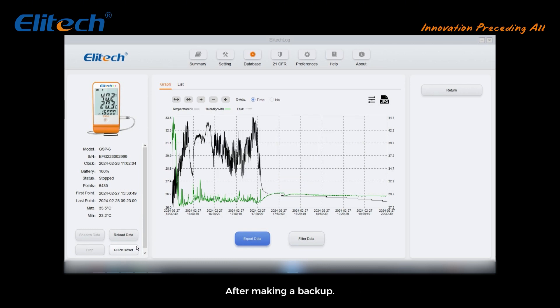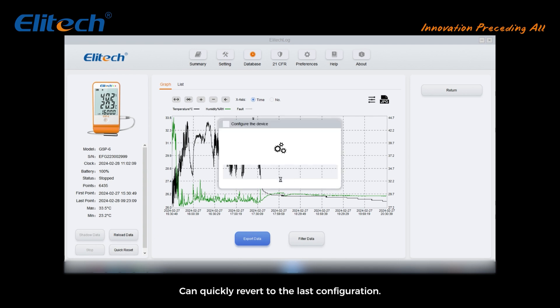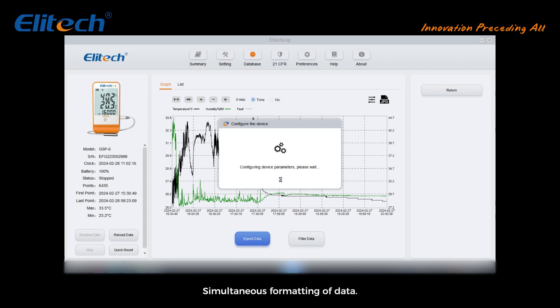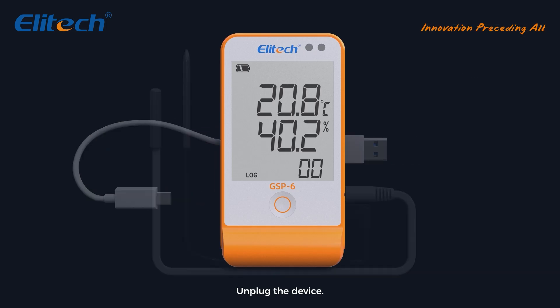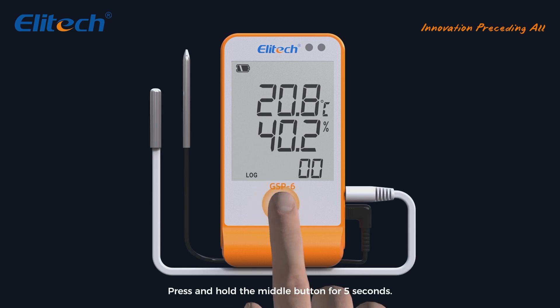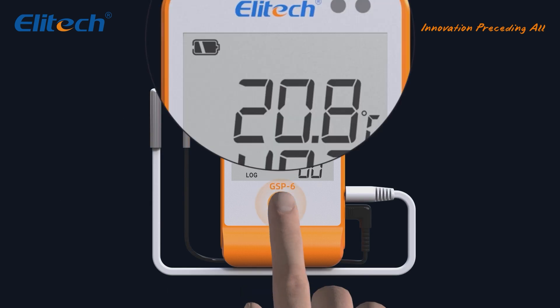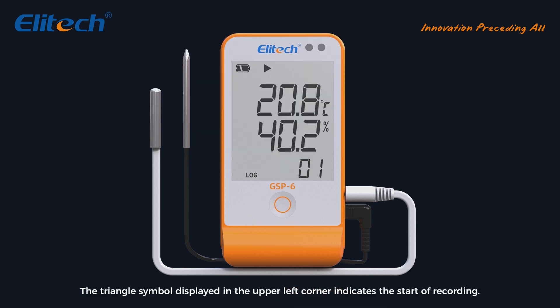After making a backup, click Quick Reset in the lower left corner. This quickly reverts to the last configuration, simultaneously formats the data, and synchronizes the system time automatically, allowing you to start recording again. Unplug the device, press and hold the middle button for 5 seconds, and the triangle symbol in the upper left corner indicates the start of recording.